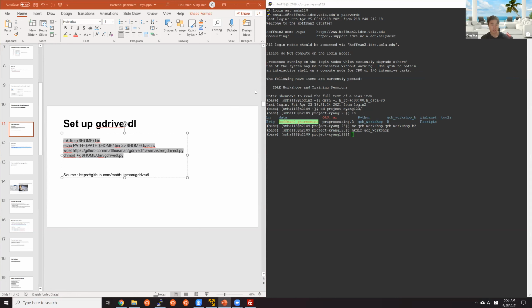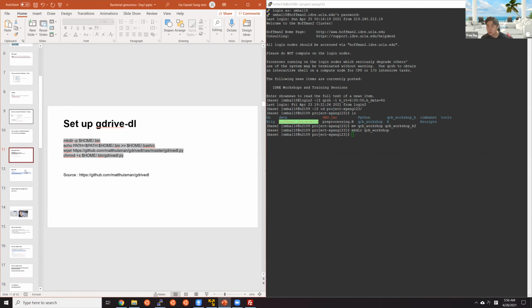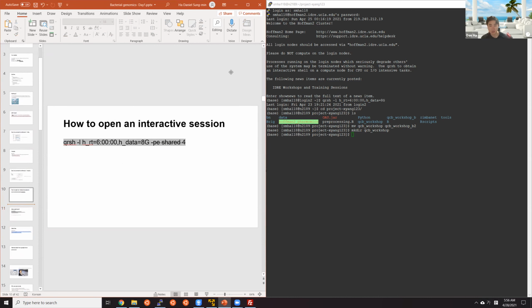Yeah, it can take some time actually. Okay. You guys didn't type in this command, right? Did you guys also type in the shared option here? Okay, so I guess you guys just need to wait there.